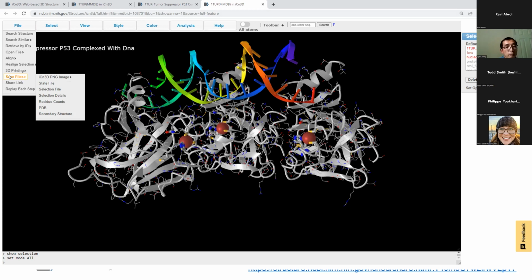And then this is only an issue right now because I think Zoom doesn't support sharing pictures. So I was just going to say share a link. But yeah, you can save it as a PNG image really easily.